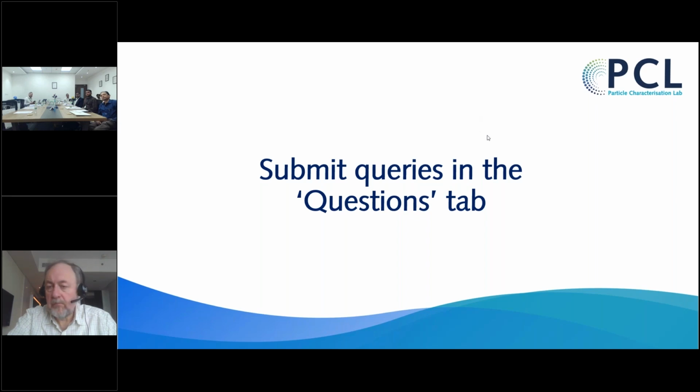Thank you, Daryl. There is another question here about, I think you covered this in the beginning of the slide, but maybe if you could repeat this part. It says, what are the inputs required for surface energy determination?